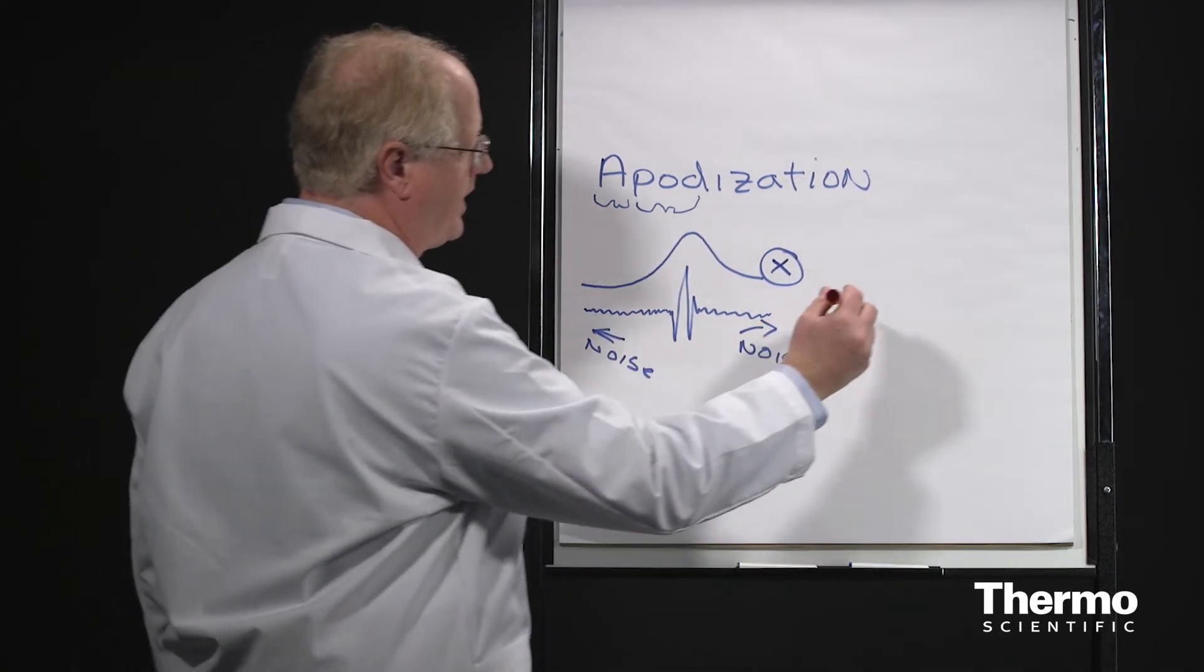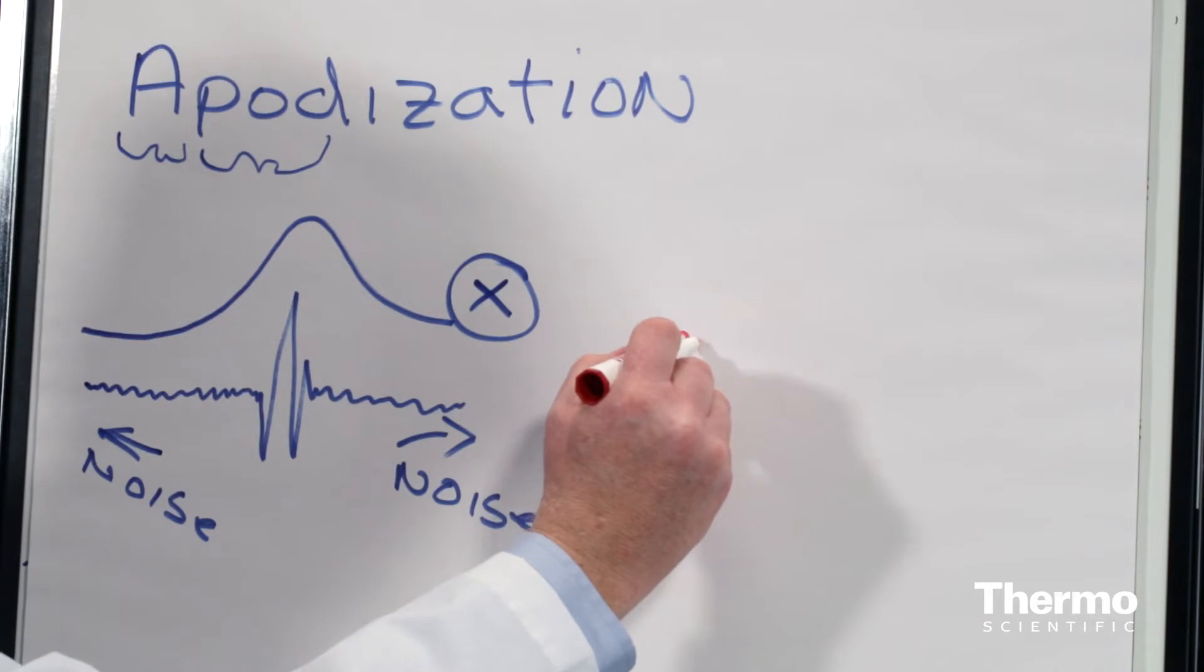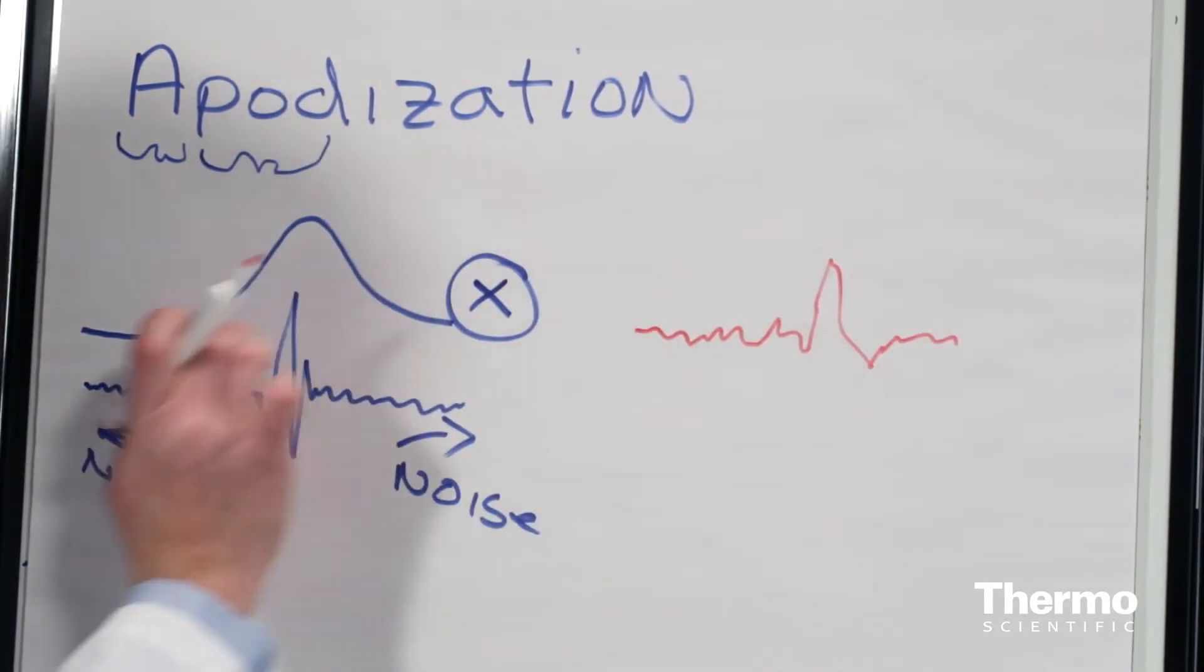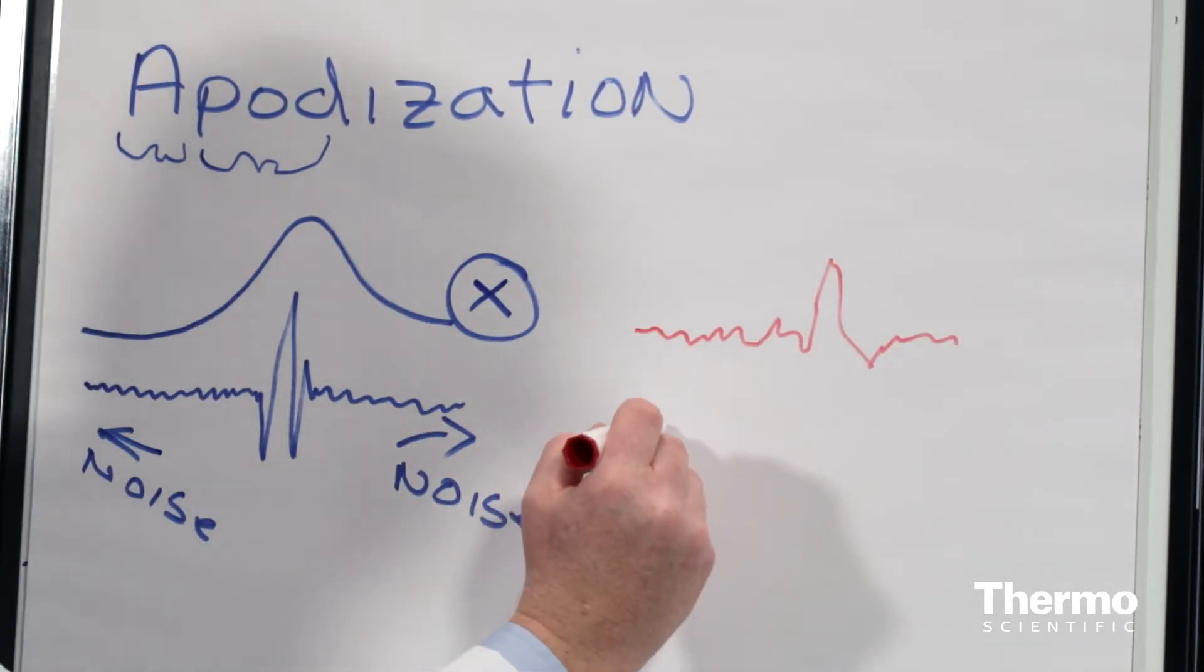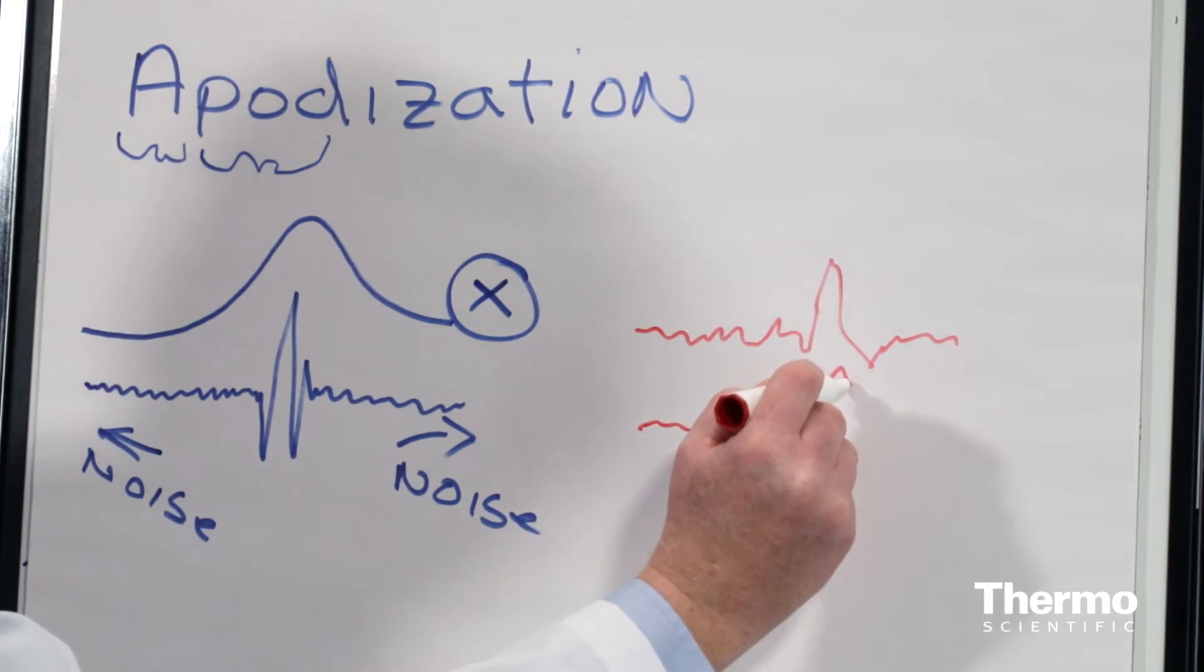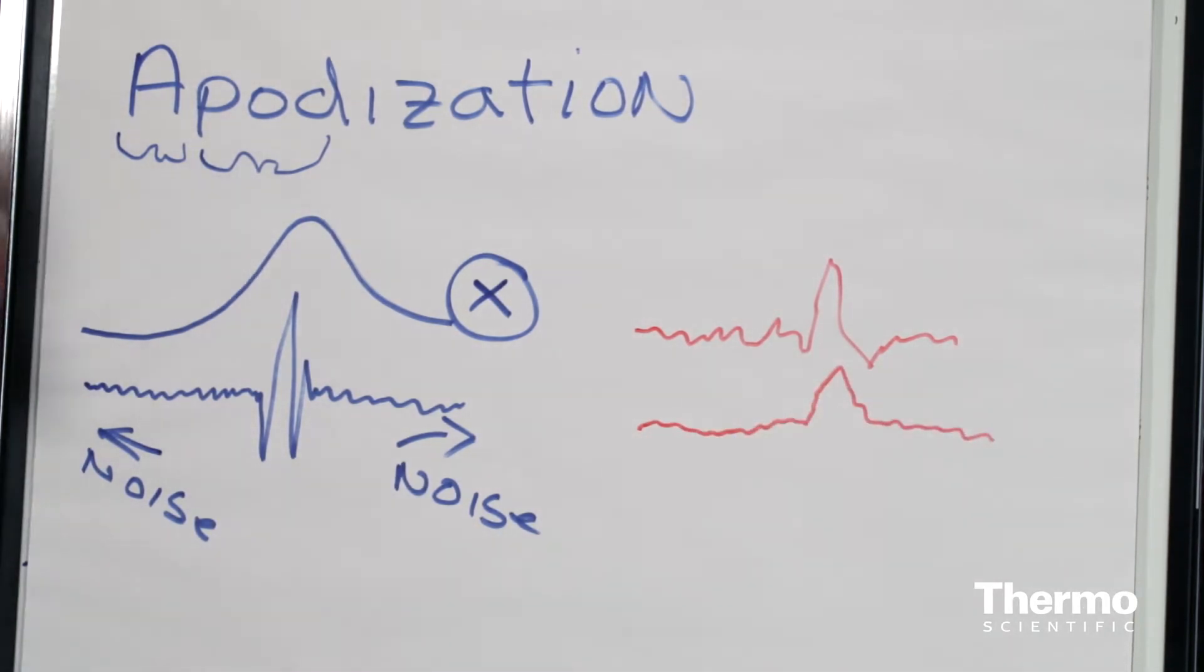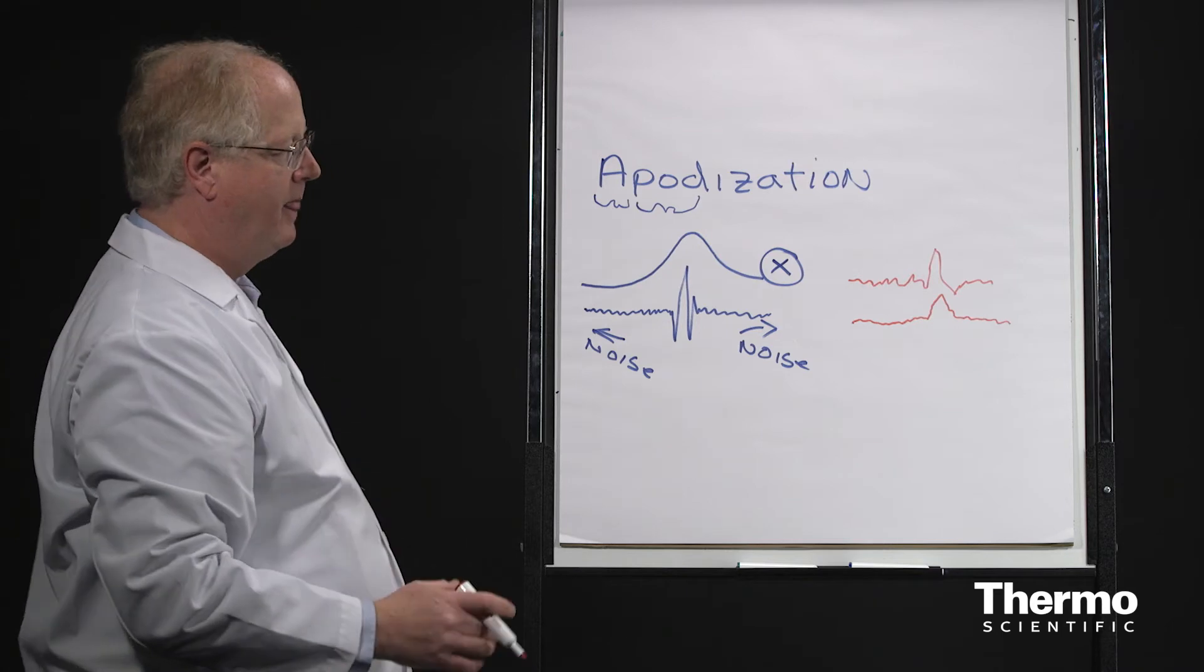So if you were to look at the infrared spectrum, you might have noise in one case, and then when you apply an apodization function, the noise would decrease. The peak would still be there, but the noise would decrease.